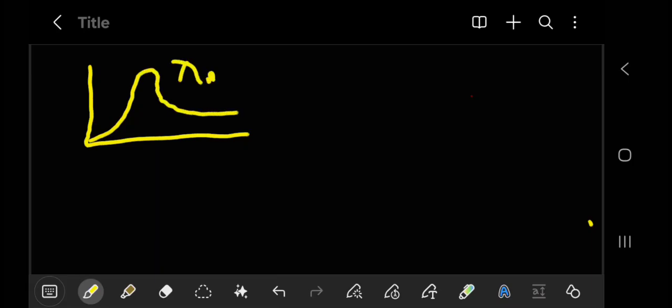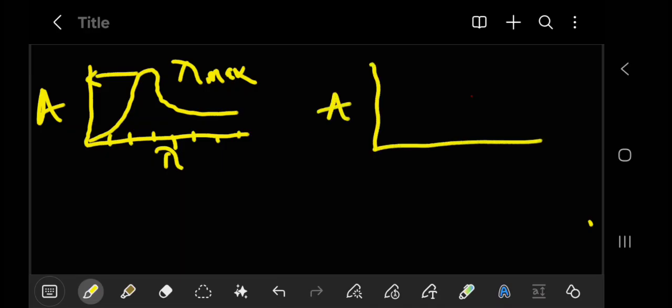That was the first thing that will give you an idea of lambda max, which I said, once you plotted the graph of absorbance against the series of varied wavelength intervals, right? So it will give you the absorbance. This is one thing you need to know because we are working with the maximum wavelength of absorption. Then secondly, you now plot a graph of absorbance against concentration of the mixture you've prepared. Each of those mixtures, you subject them, you get values.